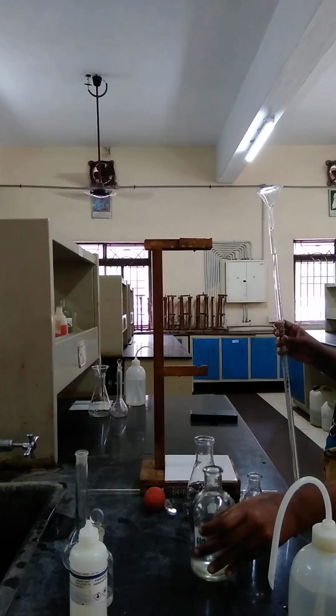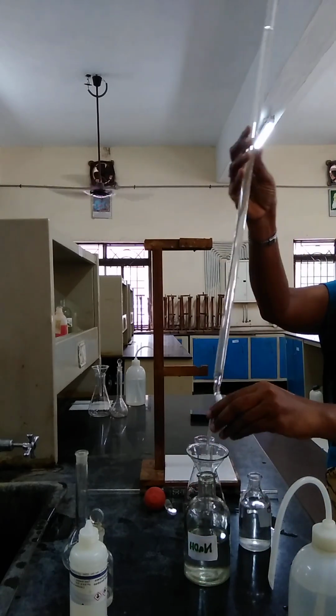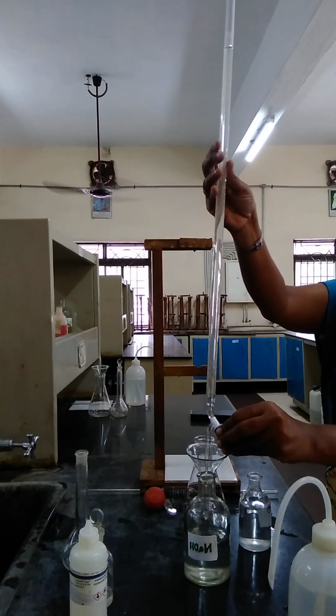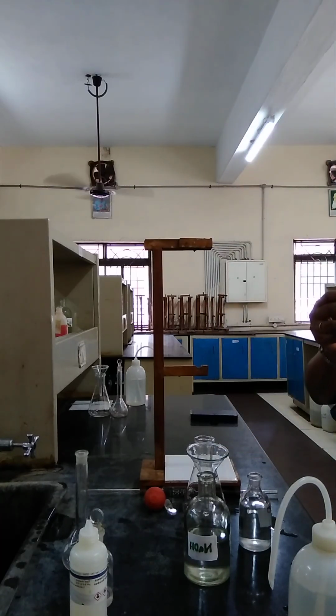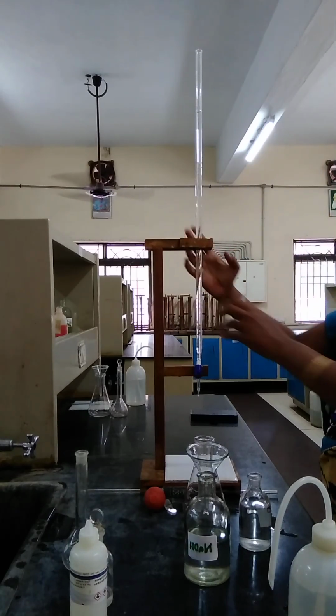So very clearly we know the procedure for the standardization of sodium hydroxide. Now set the lower meniscus matching the 0 reading for the burette with the NaOH solution.